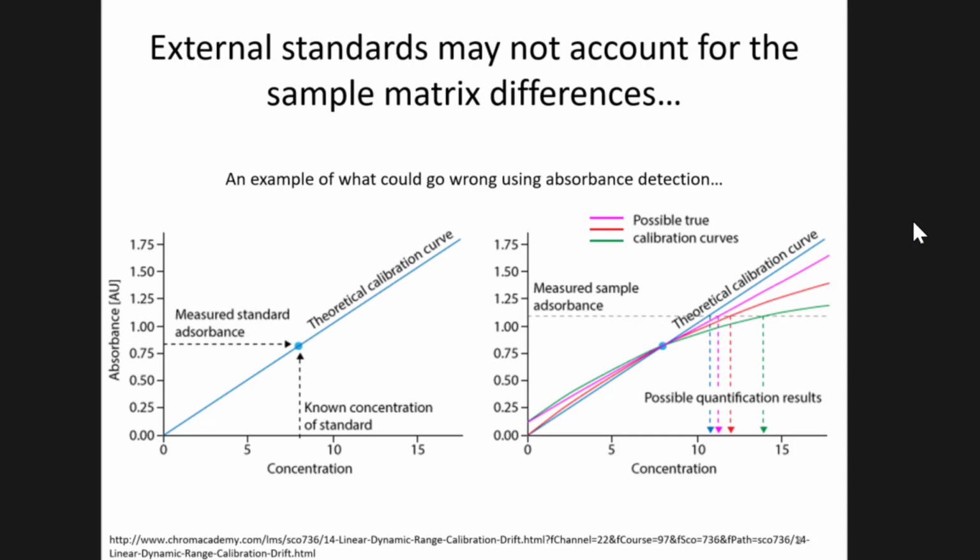But there are other things that can influence this. In mass spectrometry, we could have saturation. There could be interferences that cause the analytes to not fall on that line. And so the idea is you want to characterize your analyte in the sample matrix and potentially in very similar but other sample matrices. If you're working with plasma, you can look at pooled plasma, you can look at individual plasma, you can look at horse plasma as potential options to see if there's a chance that anything interferes.